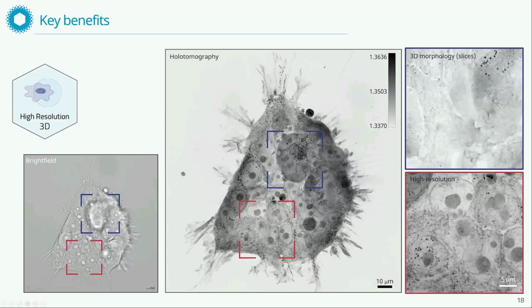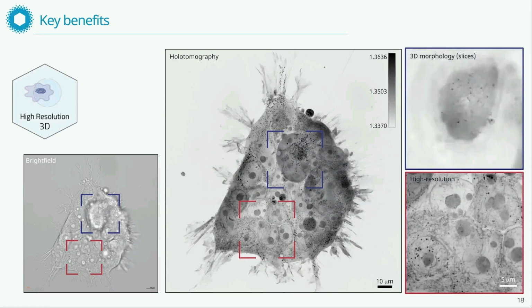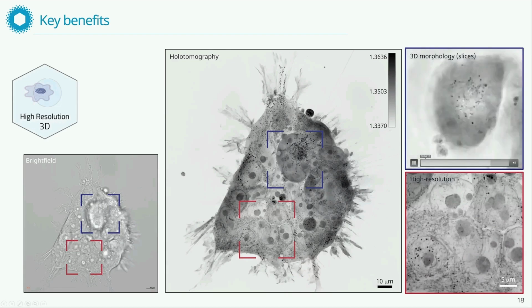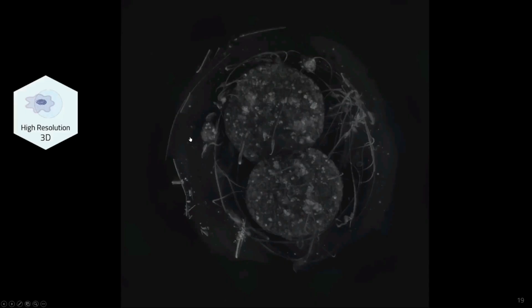And if you focus on this middle area, if you use the bright field microscope, you cannot see how many cell layers are present here. But using our optical sectioning by scanning from the actual position, now you can see the various layers present in this small field of view. So this is the power of the 3D imaging capability.